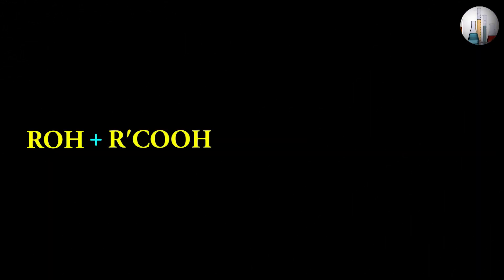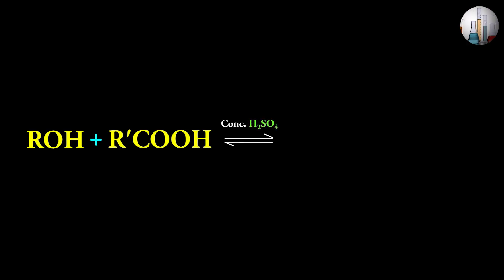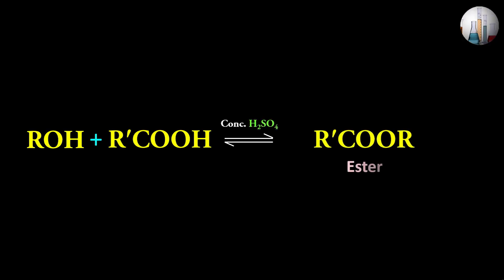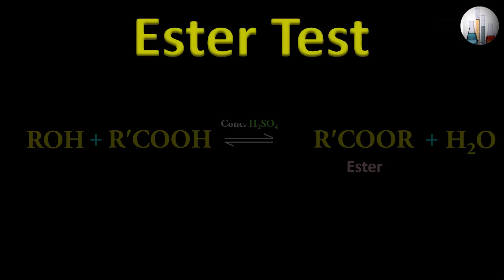Pour the mixture into about 20 ml of cold water and smell the mixture by wafting. Alcohols react with carboxylic acids in the presence of concentrated sulphuric acid to produce a sweet-smelling compound called esters. That was the ester test.